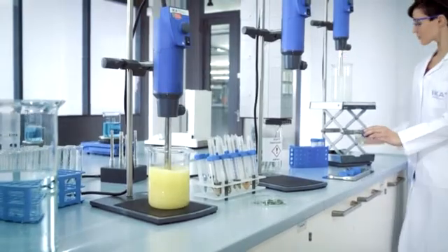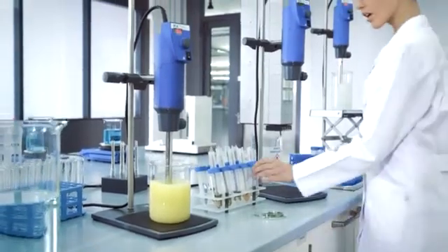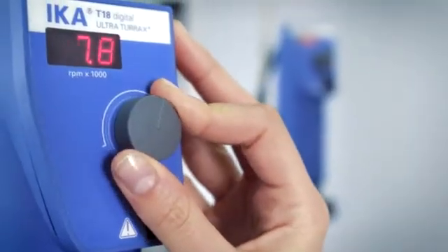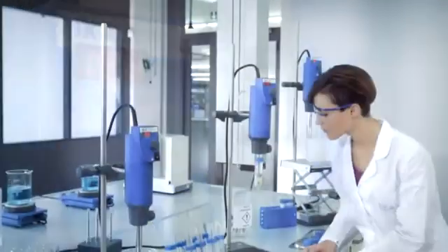The T18 digital: the low-cost entry-level dispersing system, suitable for standardized applications. A specialized tube and tool system for analytical research and sample analysis.